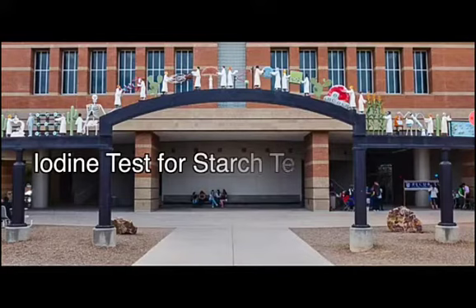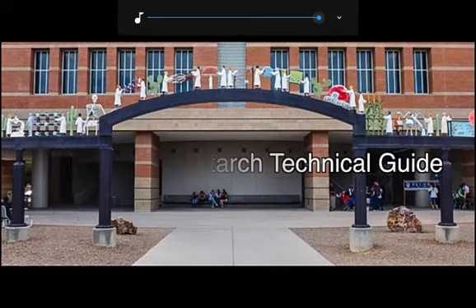Thanks to University of Arizona. In this video, I will demonstrate how to use an iodine test solution to detect the presence of starch.